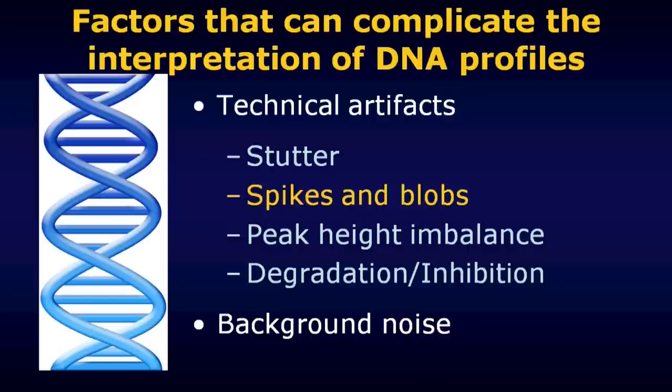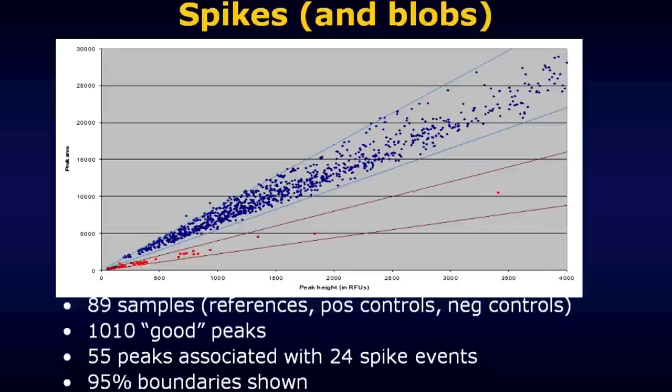Let's talk now about spikes and blobs. Right? I'm sure everybody's heard of the attack of the blob. Well, blobs manifest themselves on DNA profiles as well. They're relatively uncommon, but nonetheless something that DNA analysts recognize readily. Here's what's going on with a spike in a blob.